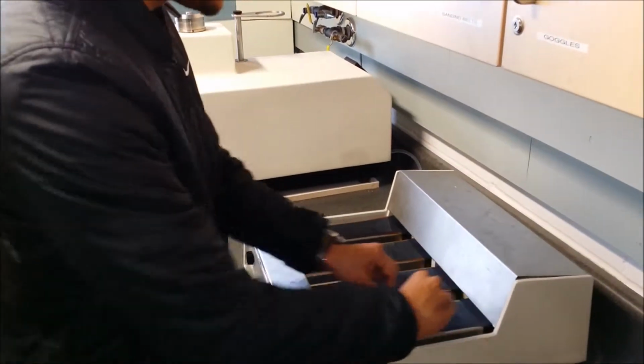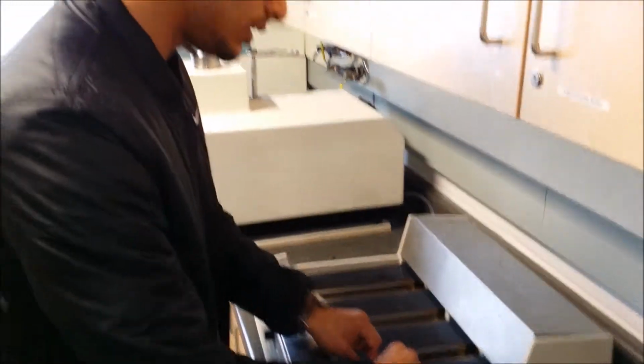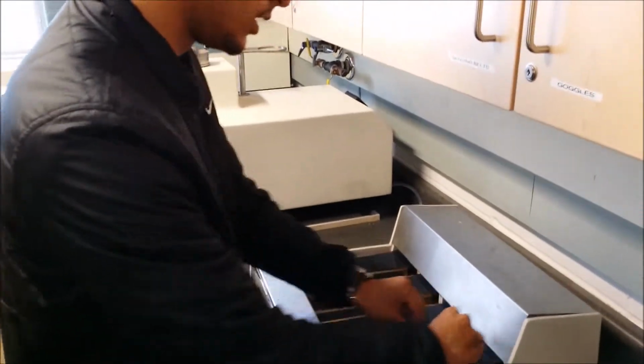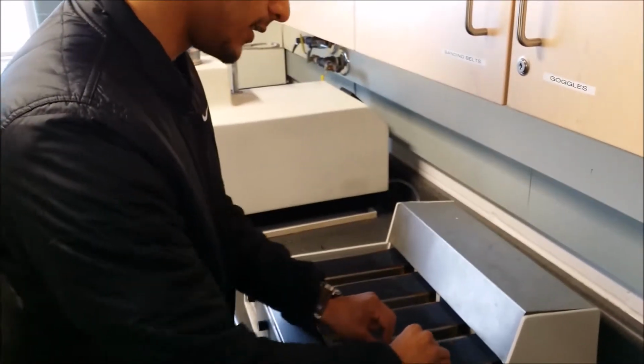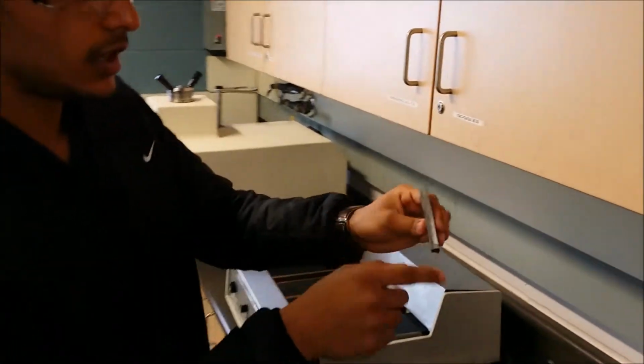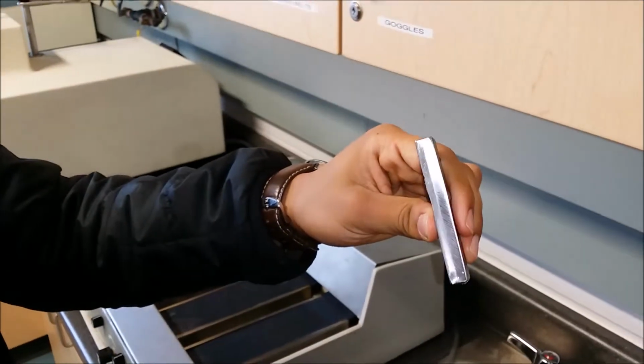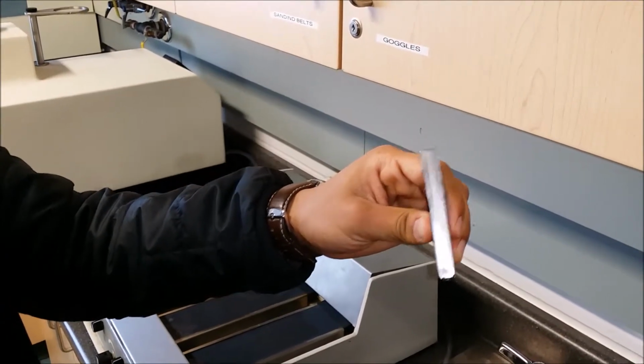This is the finest one, so I need to spend more time on this, doing gentle strokes and applying uniform pressure so that we can have uniform grinding. You see the grooves, they are like an X direction, at 45 and the other 45, perpendicular to each other, so it's a good grind.